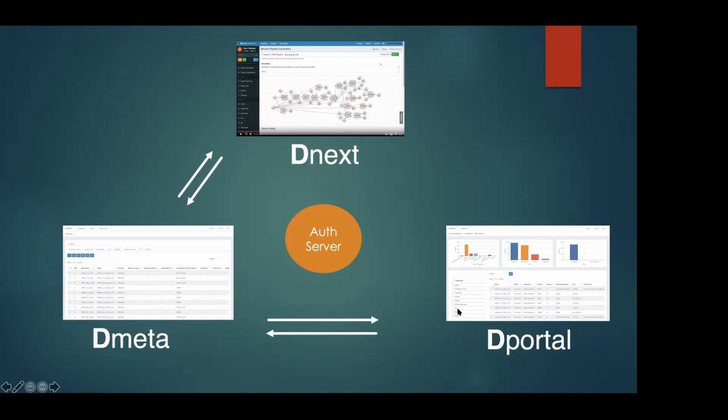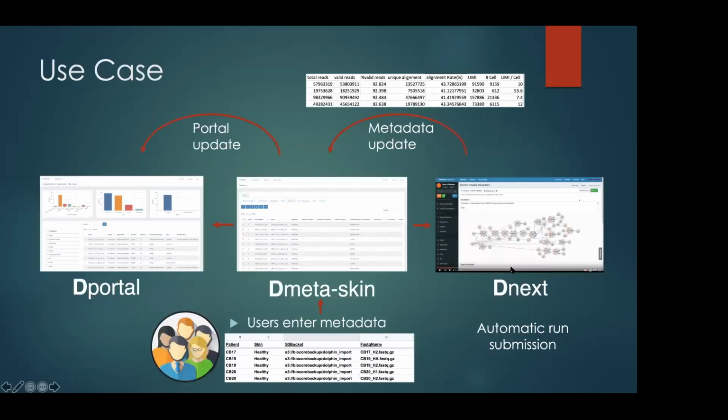If you're curious about these things, we can give you another demo about this portion. But basically, some people are entering this data into the system using these Excel sheets, or they can use the forms here. We have some event forms to update the status of the sample, and whatever is here is accessible with its own community. So, for example, if you have one community that accesses only vitiligo patients, they can only access the vitiligo data, but there is a lupus community, and they can access only lupus data in the same portal.